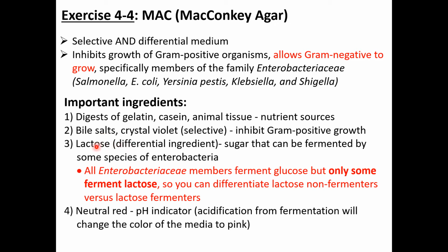So now for the differential ingredient, we have lactose, okay? And why do we have lactose instead of glucose? Well, glucose is the most abundant sugar that we know, and most bacteria can use glucose.